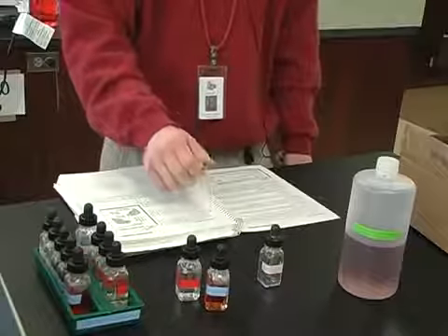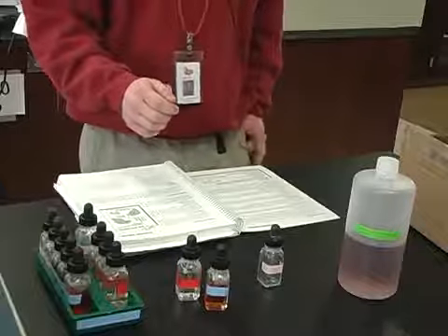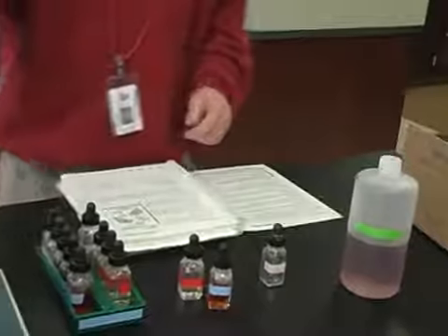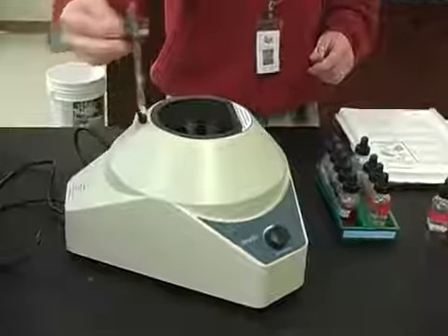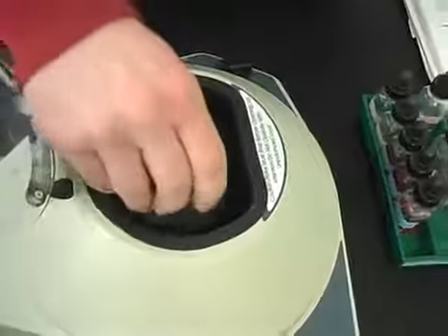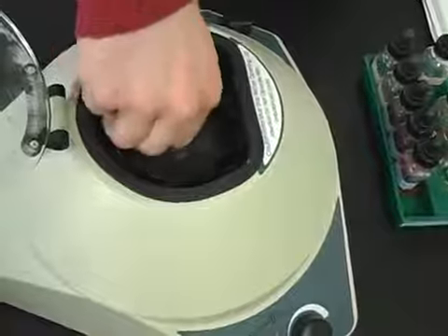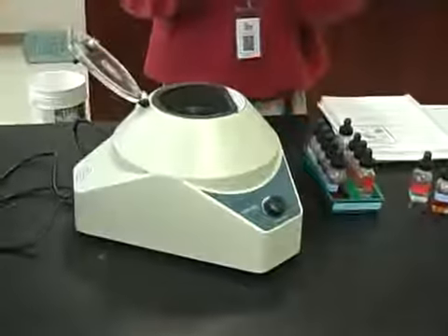Separating solids from solutions. We use what's called a centrifuge to separate the solids from the solutions. This is a centrifuge. We'll have 5 or 6 of these throughout the lab. Notice they have a little top to them, and then they have a little spot right down in here where you can take test tubes and just slide them into the holder. Okay. When you use a centrifuge, it spins the solutions around really fast inside of it.